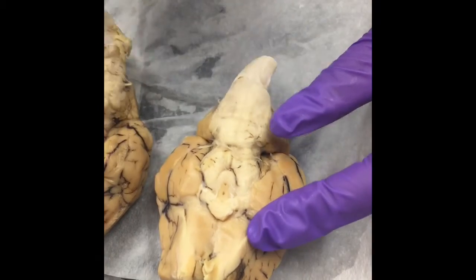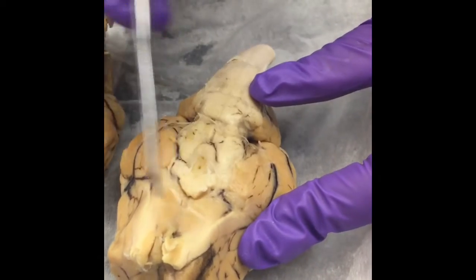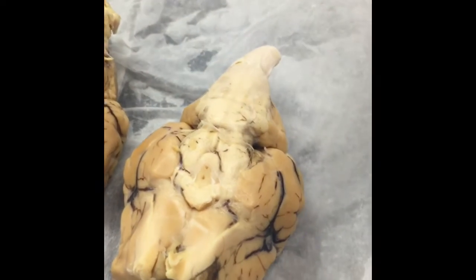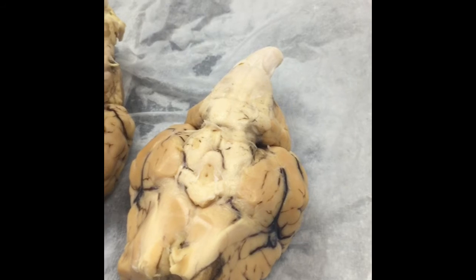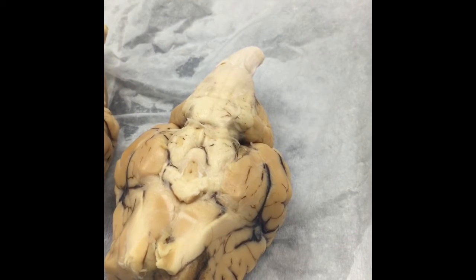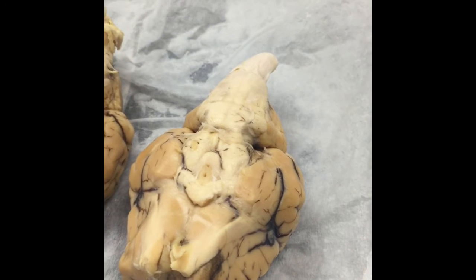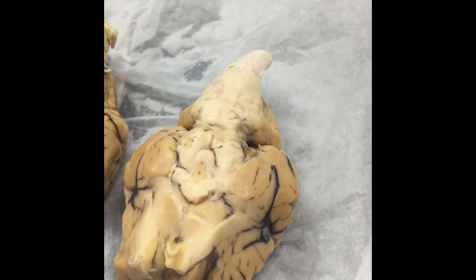Okay. So some of the cranial nerves are a little bit more challenging to see than that olfactory one. I just got a question. Like, if I'm not going to be a brain surgeon, why in the world would I need to know this? Because each cranial nerve controls a specific function in the body.